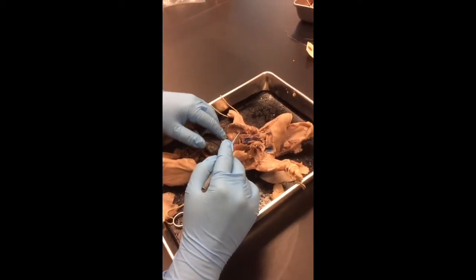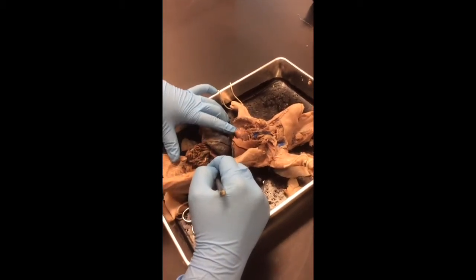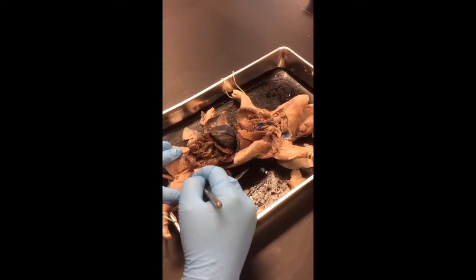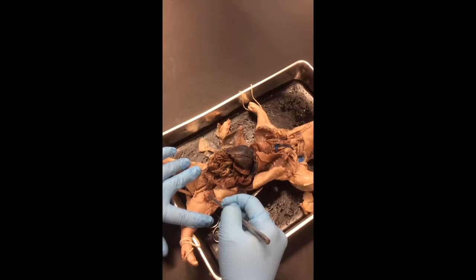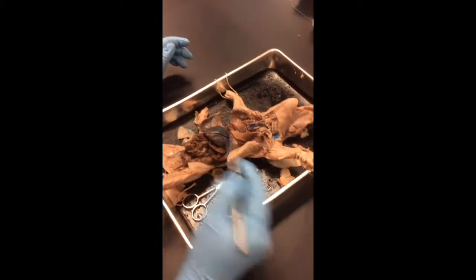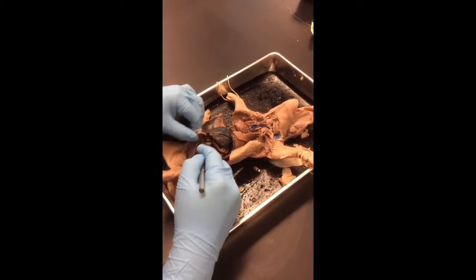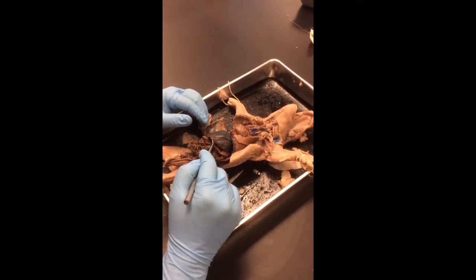Renal vein goes into the kidney. So if you see something going into the kidney that's blue, it's the renal vein. Iliac vein, if it's in the leg, I usually don't see it. I have the iliac artery, which we usually see really well, but the iliac vein, if you see a blue something in the leg, it's the iliac vein. And the umbilical vein we had to cut in order to expose this region. It was over here earlier, we cut it to expose it, so we won't be doing that one.